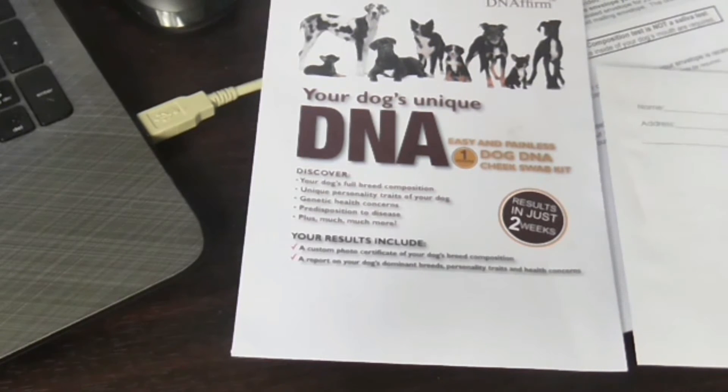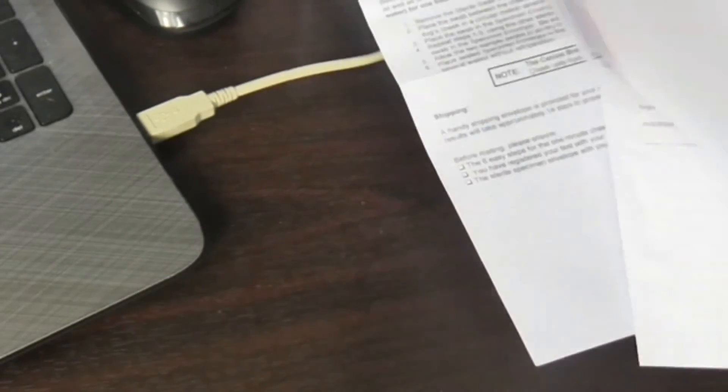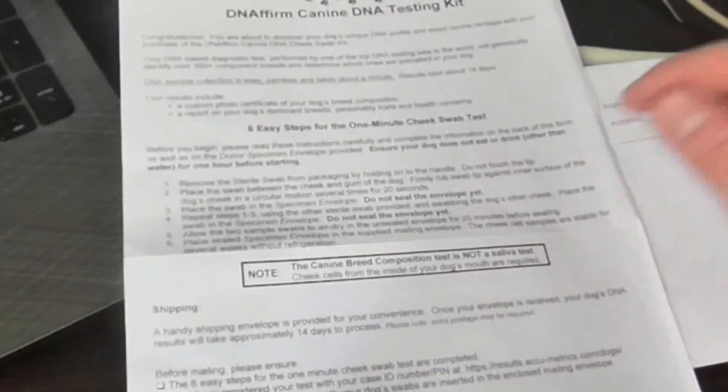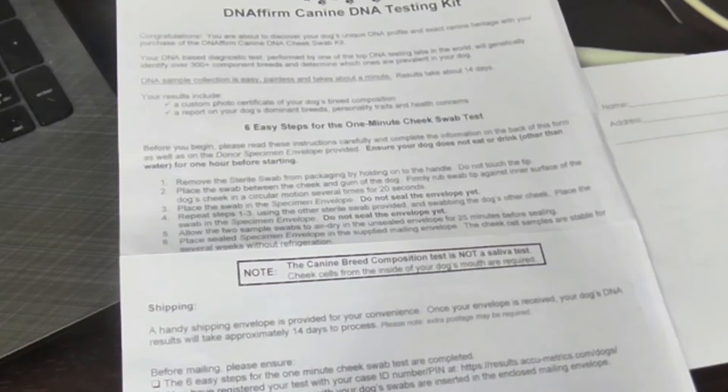This is just the instructions. It says to get the swabs out of the envelope and place the swab between the cheek and the gum of the dog, firmly rub the swab tip against the inner surface of the dog's cheek in a circular motion several times for 20 seconds.